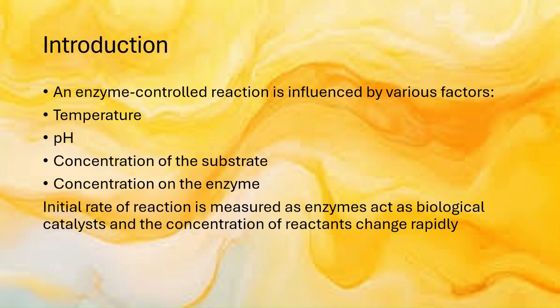So an enzyme-controlled reaction is influenced by various factors, and these factors are temperature, the pH, the concentration of the substrate, and the concentration of the enzyme. And if you want a more detailed video on enzyme-controlled reaction, like the actual theory, a video's already been posted, so do check that out. This video will only be focusing on the practical side of things.